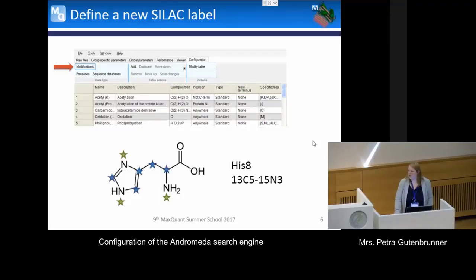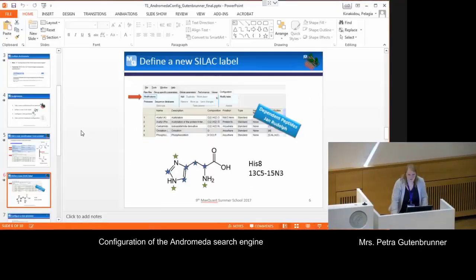Yes? How to add, for instance, heavy ones, so light variations? Because then you find in the list of the elements. And did you find the Unimod information for? Yes, for like hydroxyproline. So, Pavel? Yes.